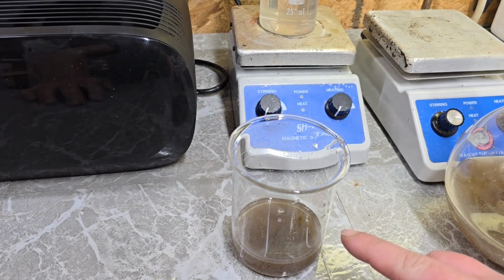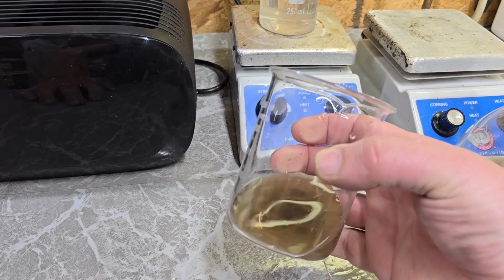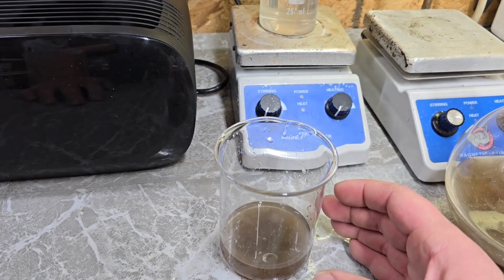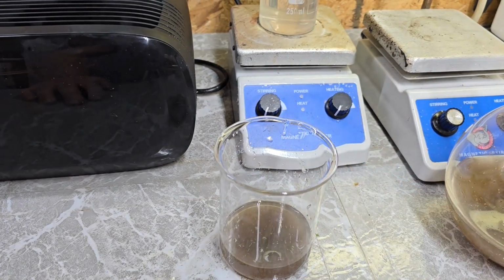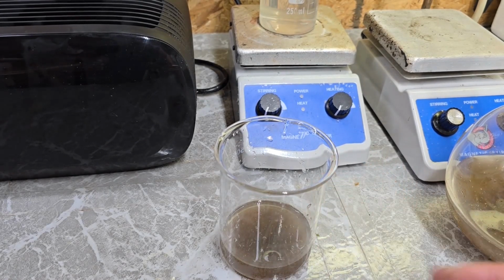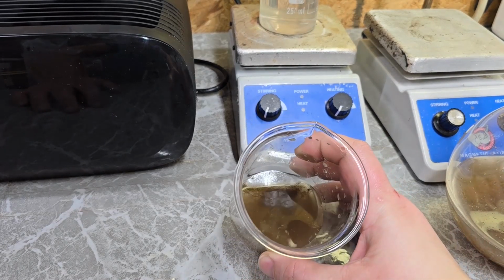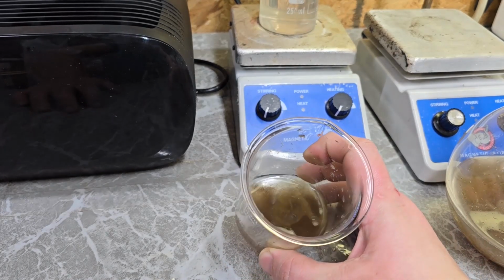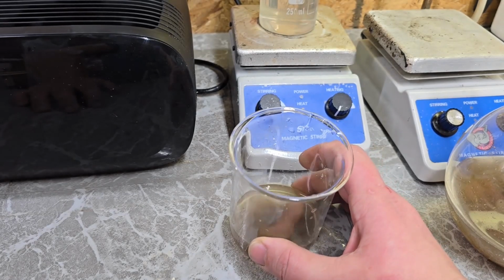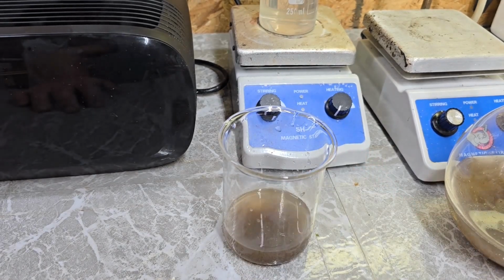So now I am going to get some watch glasses, and I'm going to put some of this concentrated solution onto some watch glasses, and then we will look at that underneath the microscope and see what we can find. First, we'll start with the stereo microscope, like a high-powered magnifier, just to see if maybe we can see some nematodes or something in here. And plus, we'll be able to look at a bigger sample with the stereo microscope. And then if we find something worth looking at, we'll go underneath the compound microscope and look at it under there. All right.